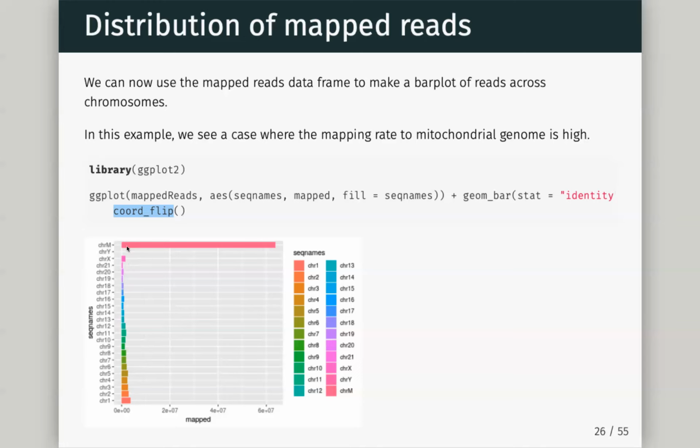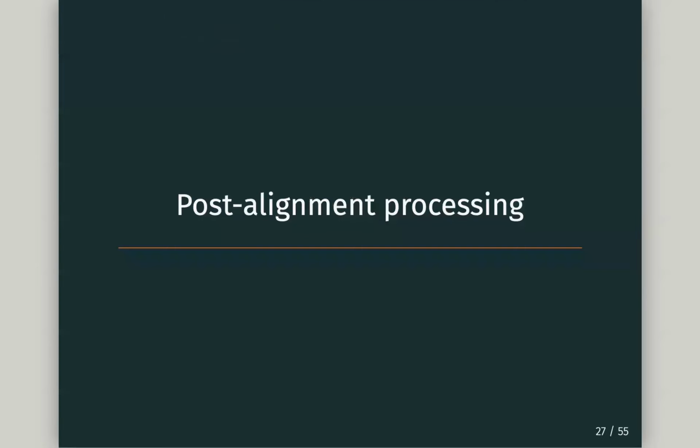Their lab has managed to clean this up. And there's things like OMNI-ATACseq, which reduces this amount of mitochondrial reads greatly. I can tell you it's still high though. So you still are spending a lot of money on these mitochondrial reads. And actually for the rest of ATACseq analysis, 99.9999% of analysis, we throw away the chromosome. It's a circular chromosome. It's very hard to analyze for mitochondria. But that's a lot of reads wasted.